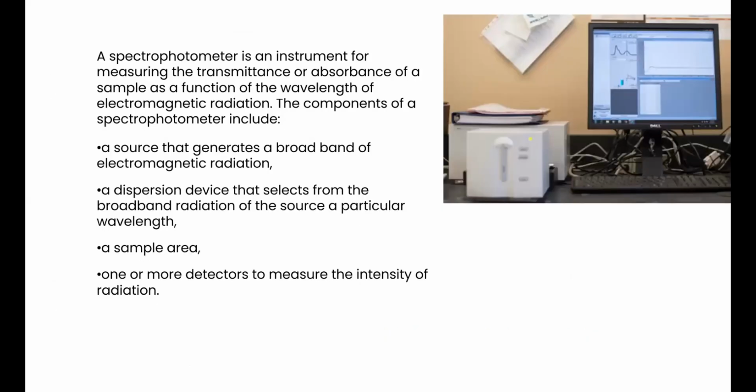Now here, this is a simple photo that shows the arrangement of a spectrophotometer machine, and this is the display unit, because these days the automated machines are there and they are connected to computerized systems. Software is there, specific for specific instruments. So not only for giving the working conditions, you can select the working environment of the instrument, but the data analysis done gets reflected on the screen in the format that you want. It may be a graph, table, pictorial, the way you want, or certain calculations if you want. All that data can be generated and displayed on the computer.